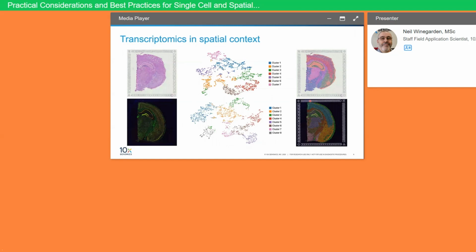In a spatial transcriptomics approach, mRNAs are captured while maintaining their relative initial position within the tissue. The resultant transcriptomic information can be overlaid back onto the image of the originating tissue section to provide a high degree of spatial resolution of the initial transcripts.